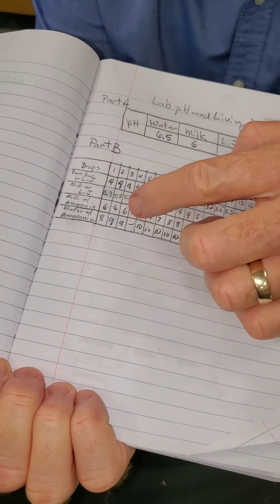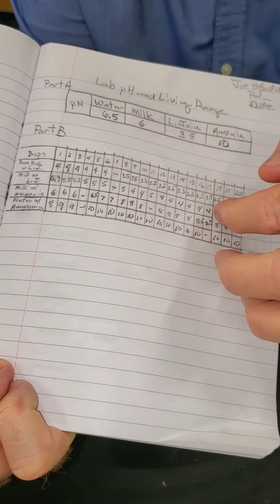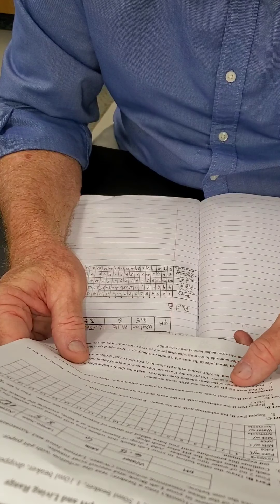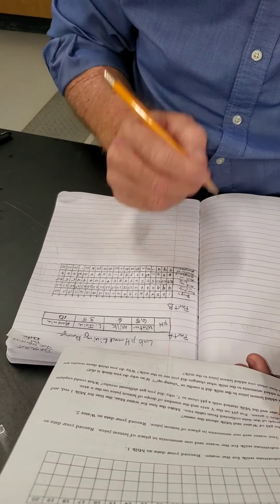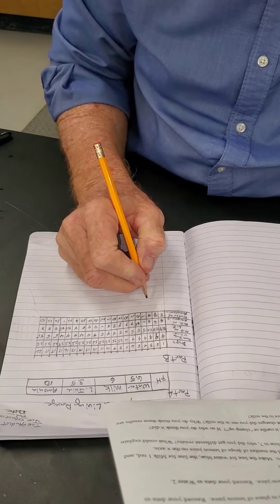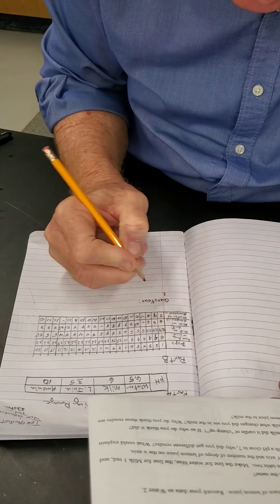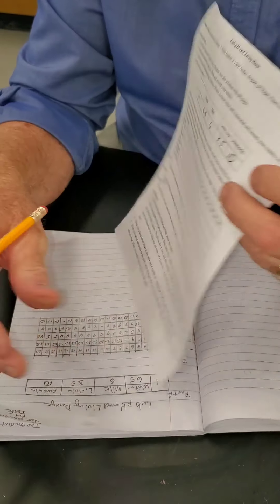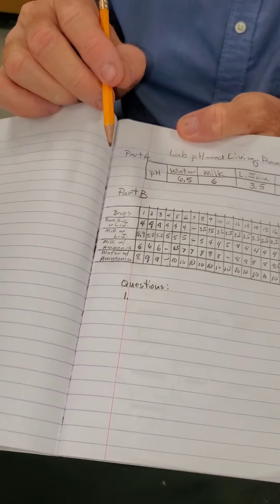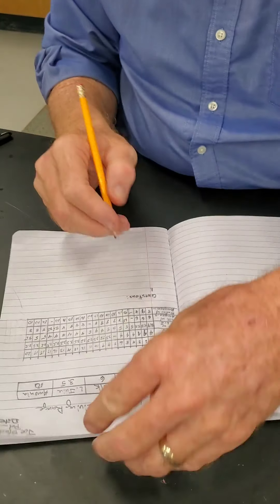In our lab book we've got some good data, and it's kind of hard to read or determine something from this data alone. So we've got some questions to answer. Question one says: at first, were the pH of milk and water about the same?